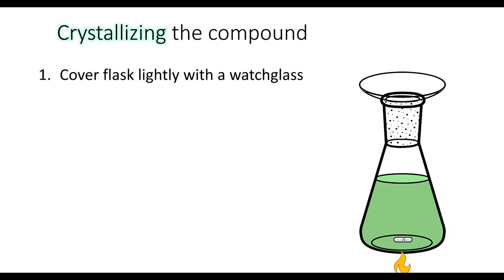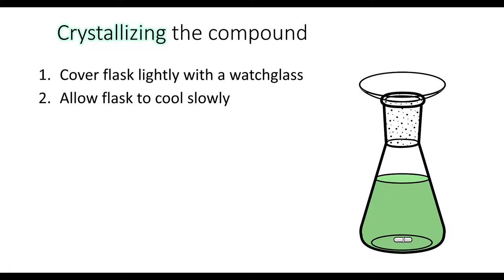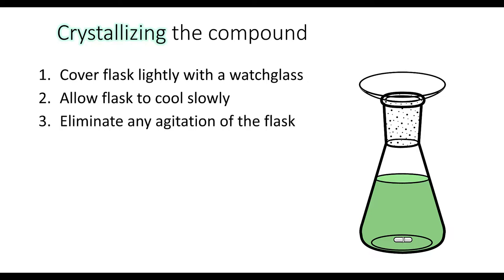We cover the flask very lightly with a watch glass, then allow the flask to cool very slowly by removing the flame or the source of heat. We eliminate any agitation of the flask — we stop the stirring and try not to bump the flask while it's cooling.